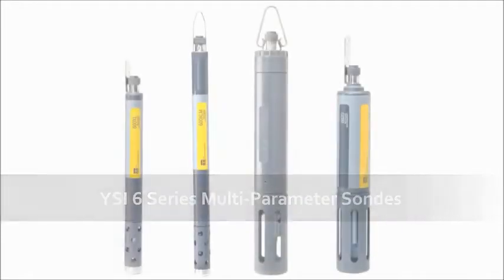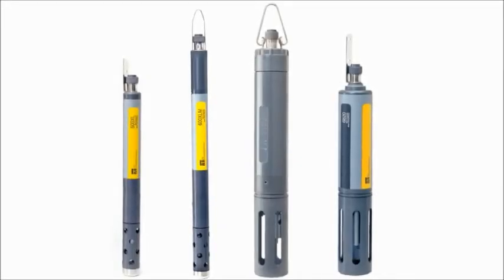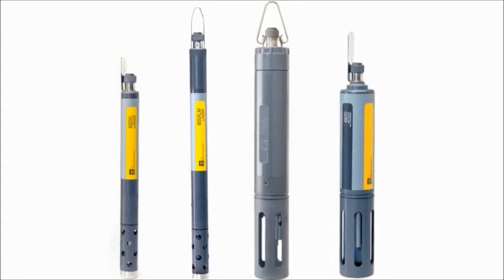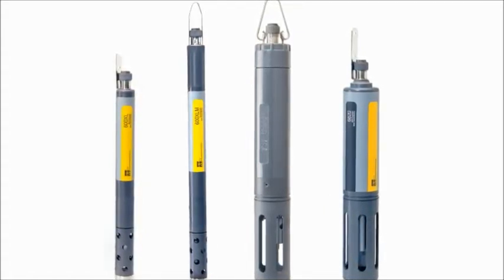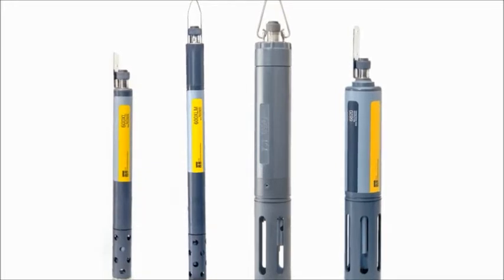The YSI 6 Series Multi-Parameter Sondes continue to be one of the most rugged, reliable, and accurate water quality instruments, and a favorite for numerous applications, specifically groundwater monitoring events.